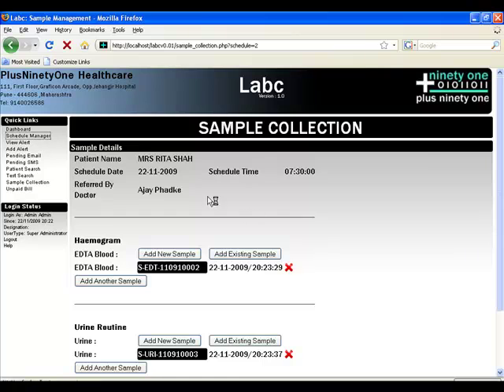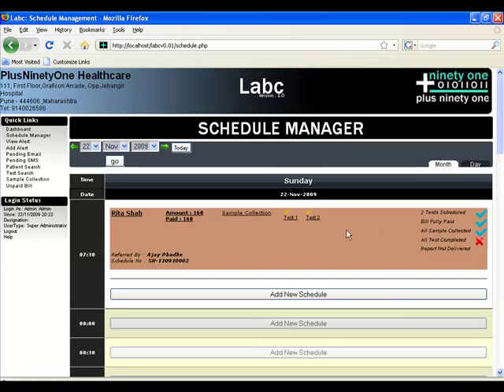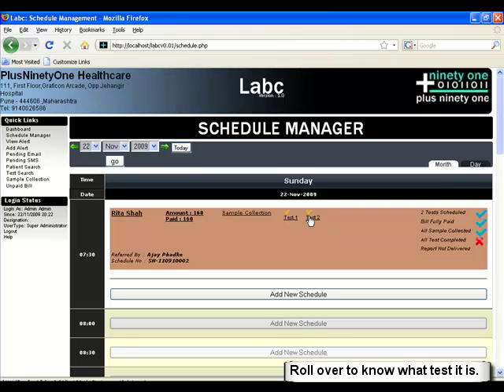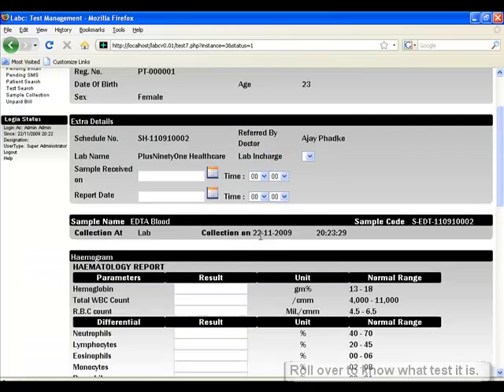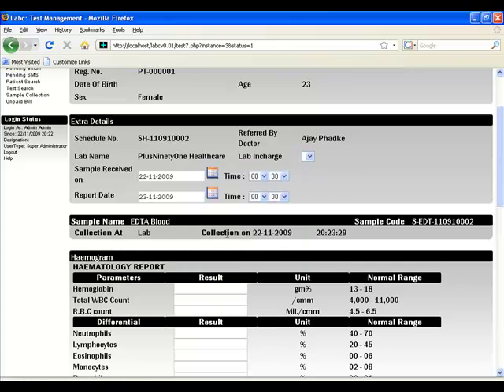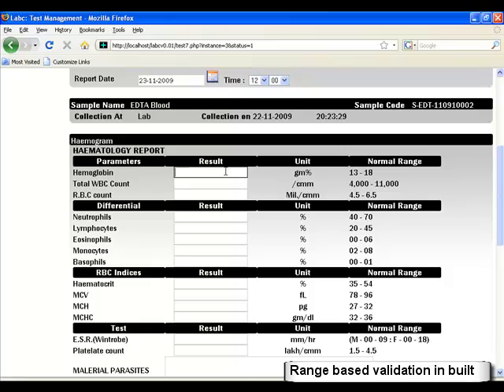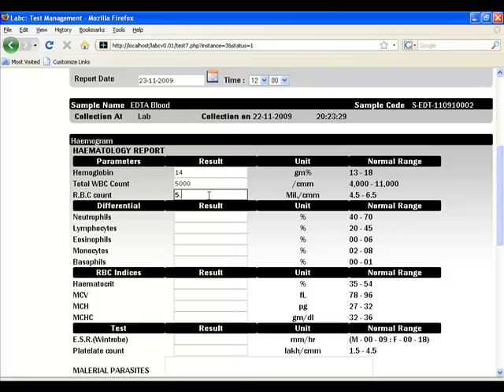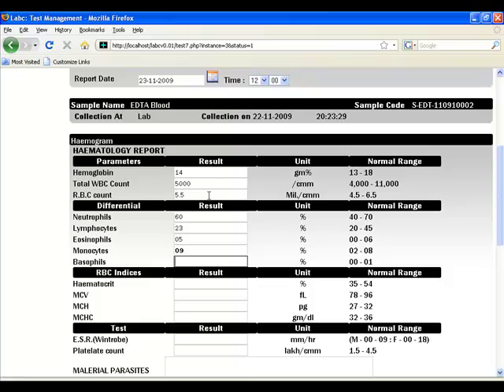Once the sample collection process is completed, you can move forward and fill in the test report entry. Moving your mouse over will let you know which test is which. Select the sample receipt date, enter the report date, and then go on and fill out the template. As you fill the template, you will see that units and normal ranges are already included. Any value which is outside the normal range will automatically be highlighted in bold, giving the doctor and technician valuable input so that no value is overlooked.